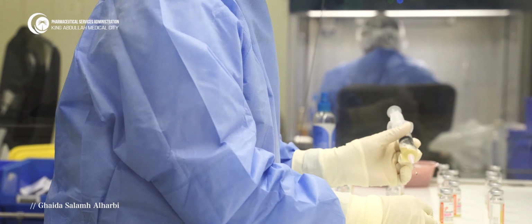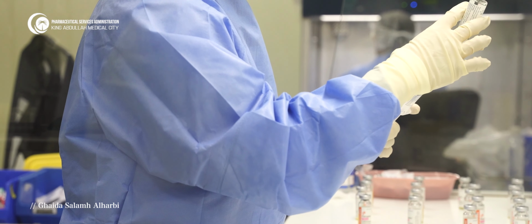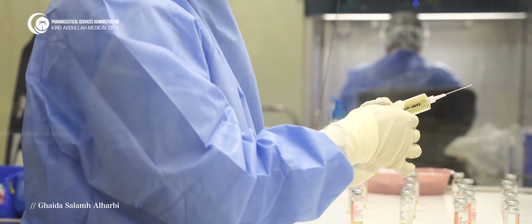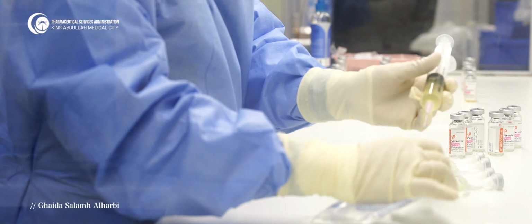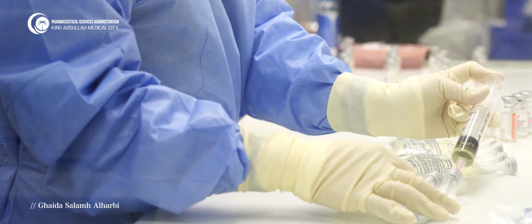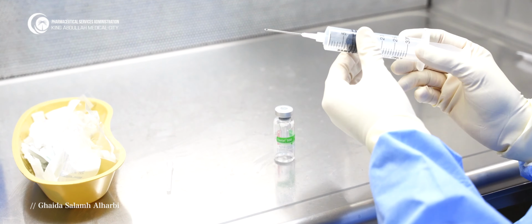Also, while withdrawing, I shall not touch the plunger. I shall not touch any critical part of the needle, of the vial, of the bag, to avoid introducing any contamination inside.